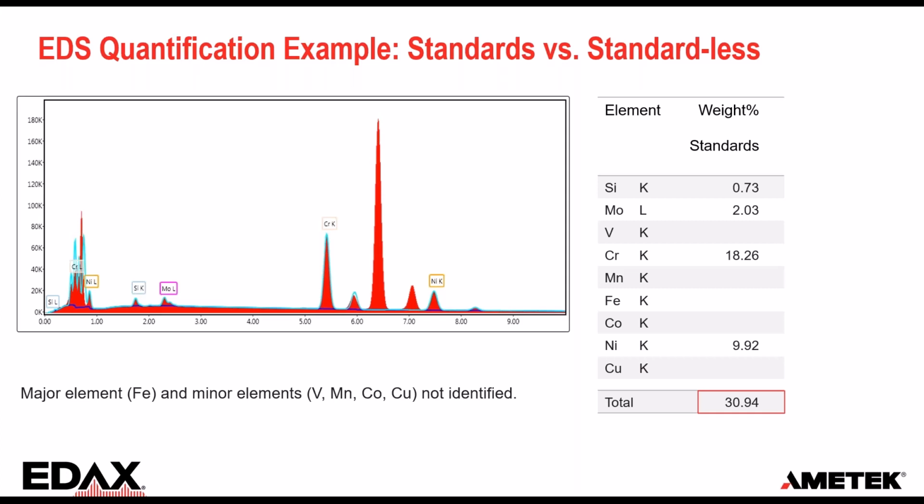And this is actually a very effective way to turn an iron alloy into a chromium nickel alloy with standardless normalized quantification. And you should always be aware that forgotten elements, artifacts, or surface contamination affect the quantification of all the elements, and that the results are not independent.